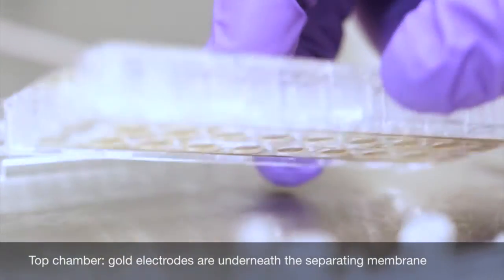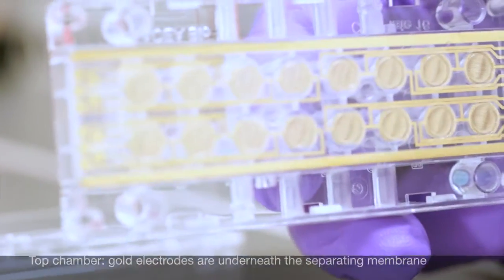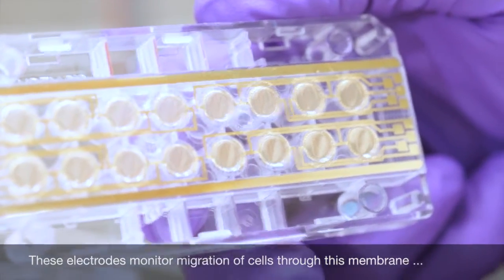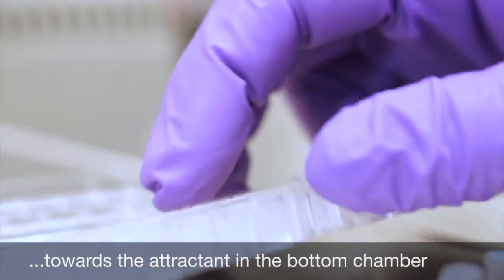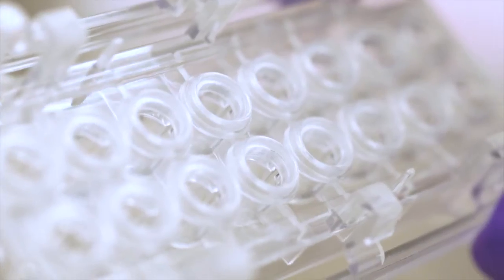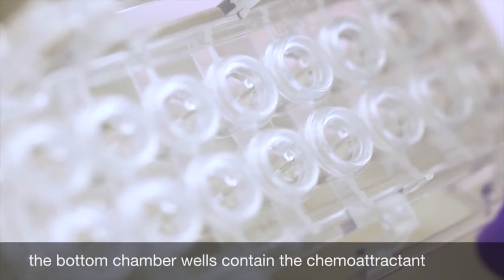The top chamber is equipped with gold electrodes right below a separating membrane to measure the impedance. Migration of cells through the membrane is measured by changes in impedance values. Migration is triggered by the chemoattractant in the bottom chamber.